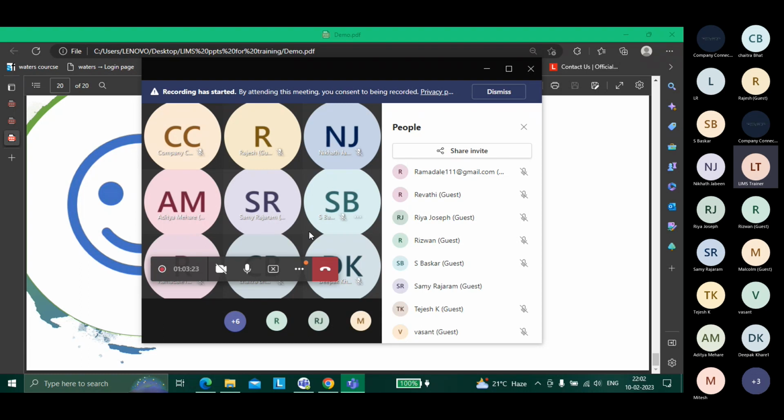Someone has to start. You need to start writing queries from select star. Then you come to joins. Then you understand how table structures and building LIMS work, right? Then you write select star; somewhere you have to start, right? That's where somewhere you need to brush up, for everyone who starts from day one.